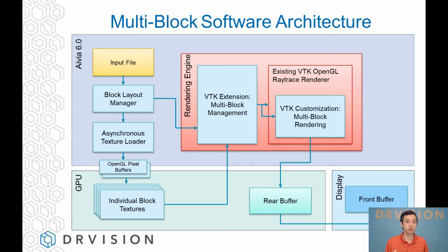More traditional approaches would be when you load the GPU with your data, it sort of halts all the processing and you wait. But here we do it asynchronously in the background. So on the GPU here at the bottom, you just build up more and more texture blocks. And so for a given position in your data, say the first block, we'll call it block 1, you might have a really low resolution version and a higher resolution version.